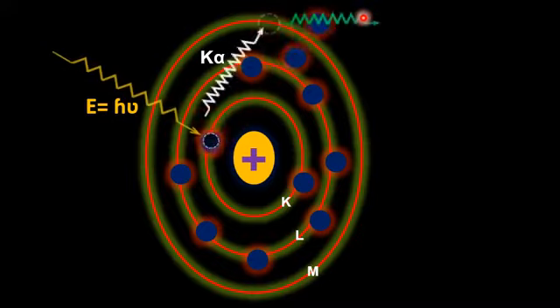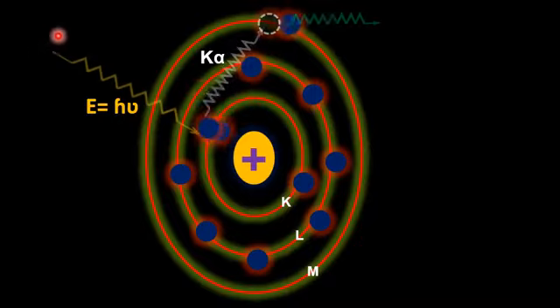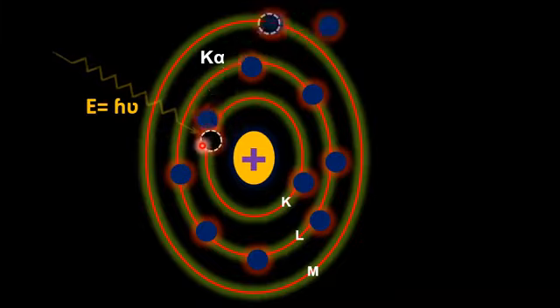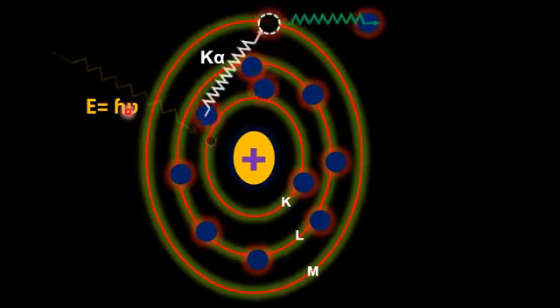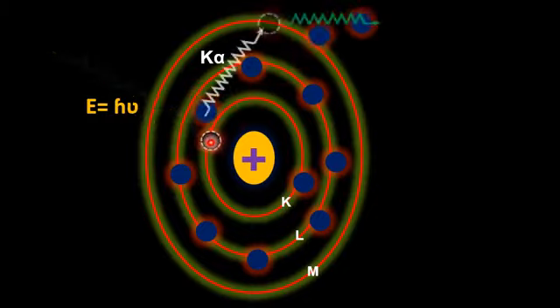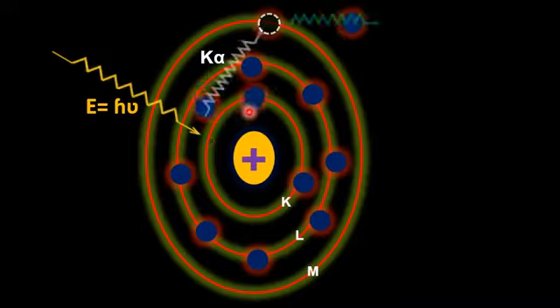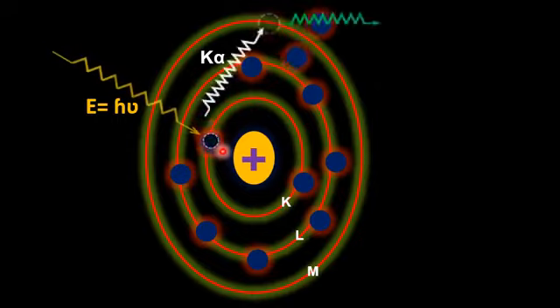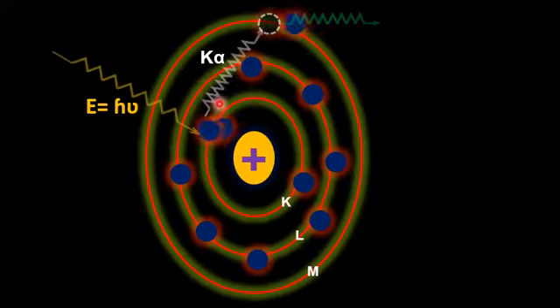So dear student, in simple words, in Auger electron spectroscopy, an electron gun is used to direct a stream of a highly energetic electron beam onto an atom, and that beam causes the emission of a core shell electron. Due to the removal of the core shell electron, a higher energy electron usually jumps into the vacant position, and during the transition from a higher energy level into a lower energy level, the electron emits characteristic X-rays.